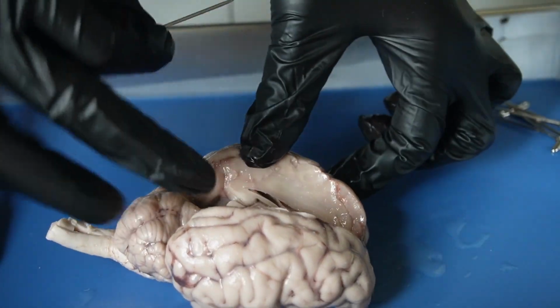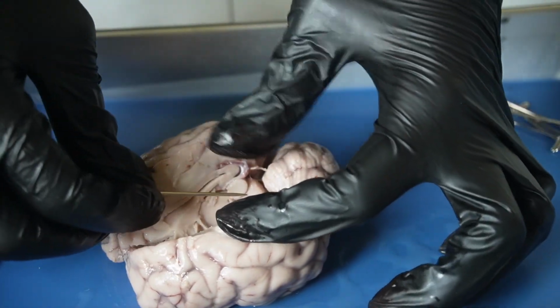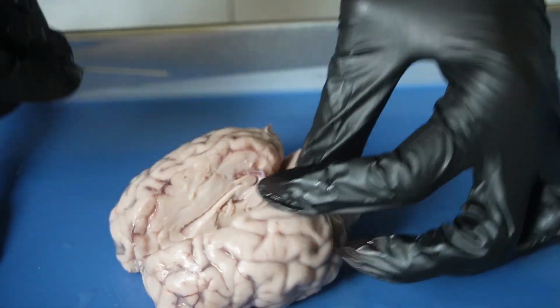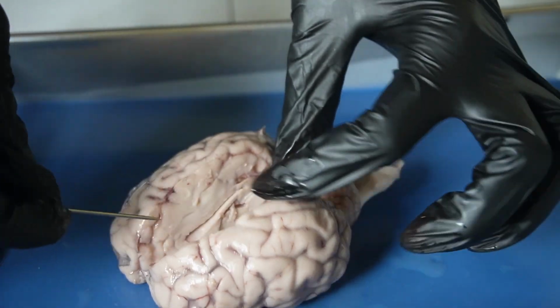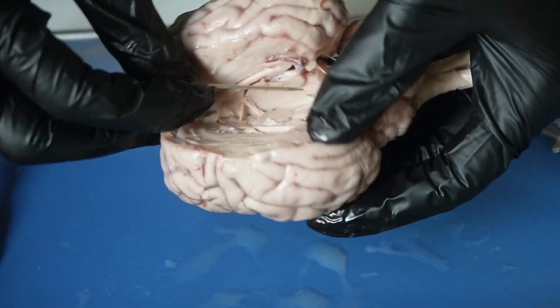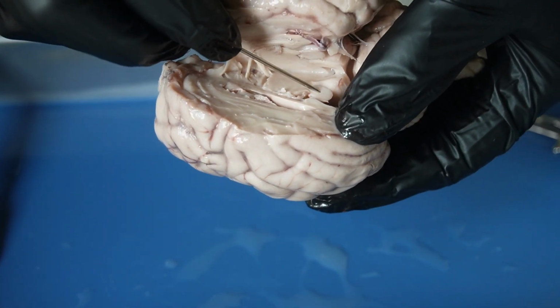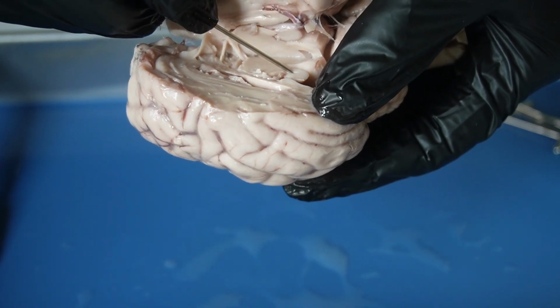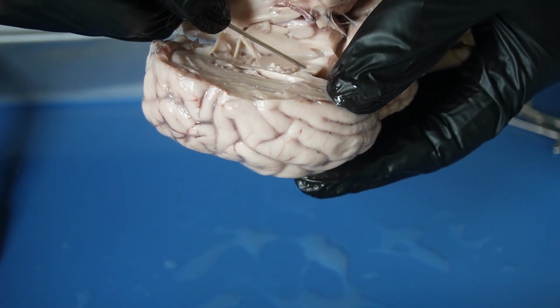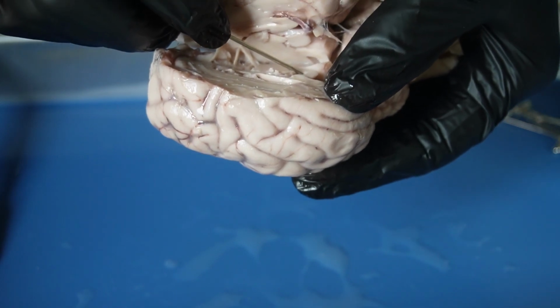So the next brain structure is the amygdala. Well, actually, no, not the amygdala, but the pituitary gland, which is here. And the pituitary gland secretes hormones to the rest of the glands within our body that facilitate functioning.